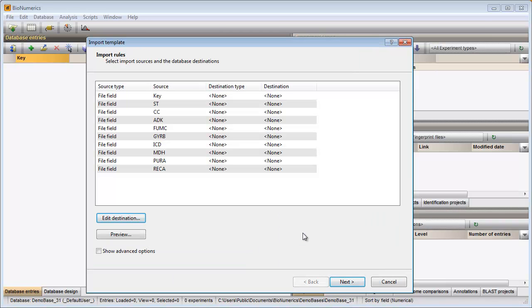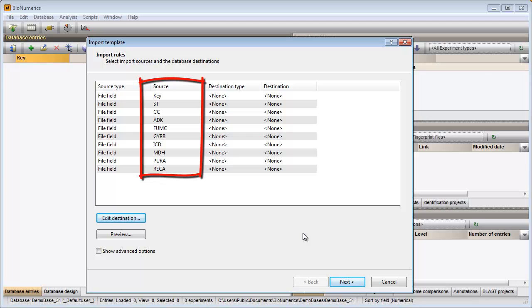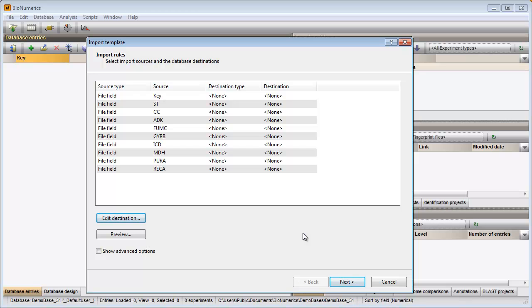In this step I need to define the import template for my data format. The column names found in the Excel file are listed under the column Source. In this grid I can choose what information from the Excel file I would like to import into my database.